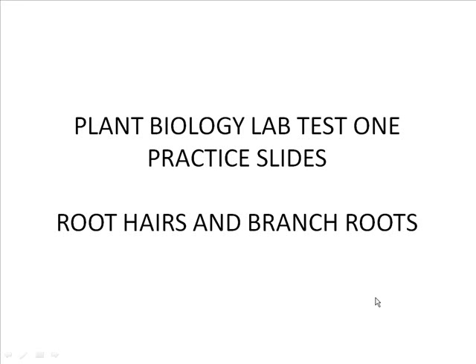All right, we have some practice slides of root hairs and branch roots. Also, if you didn't finish your drawings on these, this will give you some pictures to draw. You can just stop the YouTube video and use these for your lab drawings if you didn't get a chance to finish in class. Also, I said lab test one, but in all these practice sets of practice slides, I'll also mention things, ask about things that could very well be covered on the lecture test as well.